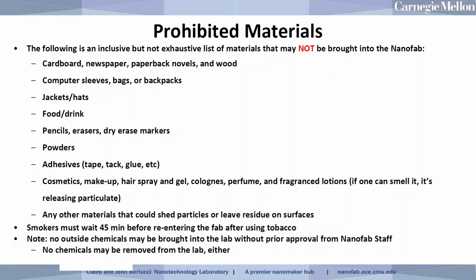Any type of cloth material that might be on a computer sleeve or backpack or a bag or something we would want to avoid. While we mentioned that you can bring in your laptop and chargers and cell phones and things like that, carrying cases we want to avoid because they're difficult to wipe down. Any type of fabric-y material is going to trap particles and potentially be a contamination risk. In the same vein, jackets or hats or any type of outerwear should be left outside the clean room.